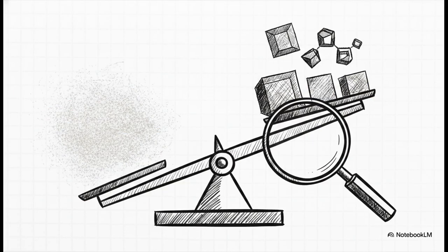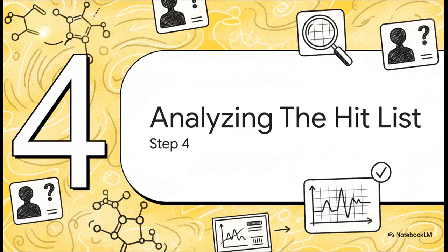So the crucial point is that second step, weighting heavier mass peaks more heavily. Now, you might be wondering, why does the algorithm do this? Well, small, low-mass fragments are super common across thousands of different, totally unrelated chemicals. They're basically background noise. But the heavier fragments, the ones with a larger mass, those are much more characteristic of our specific compound. The algorithm knows that the heavy pieces hold the real clues, so it prioritizes them during the search.